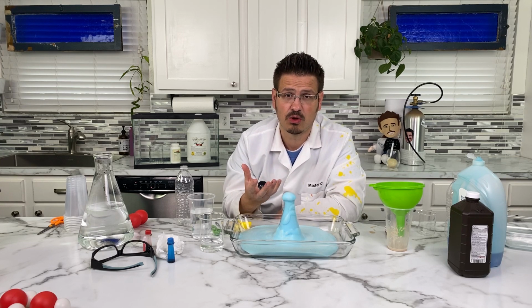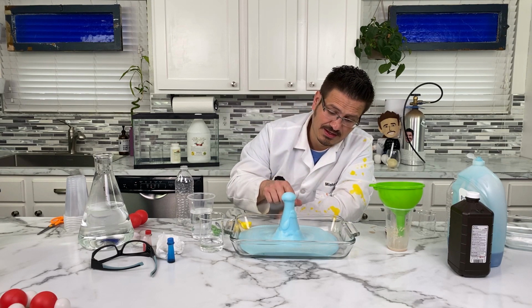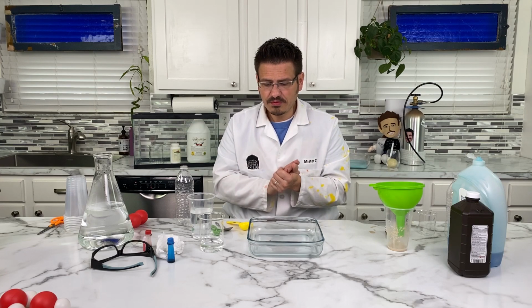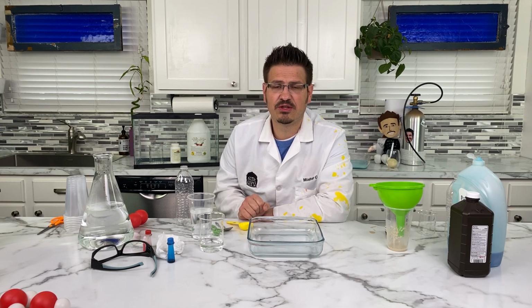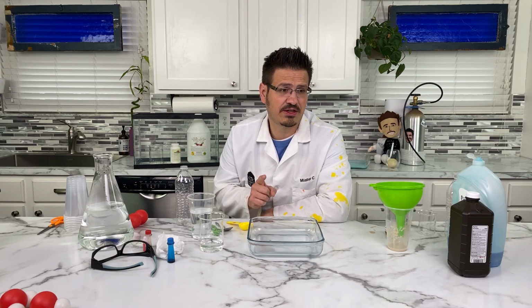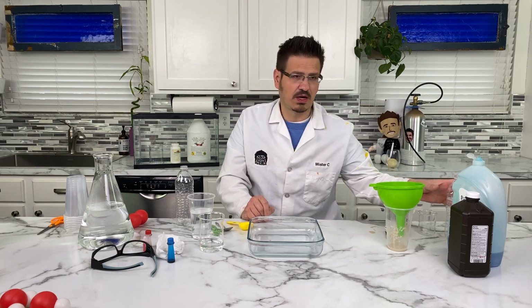So maybe we do it without the soap and see what happens. Isn't that cool? What I want to also say is this. I think we should try this again, but I want to change a variable. I've just been thinking about this. What if we don't put the yeast into the water? What if we just put the yeast straight into the hydrogen peroxide? I've never done this, and I'm just curious if it'll work or what it'll do. And so I think we should try that.